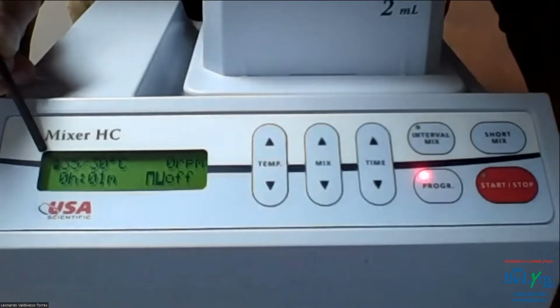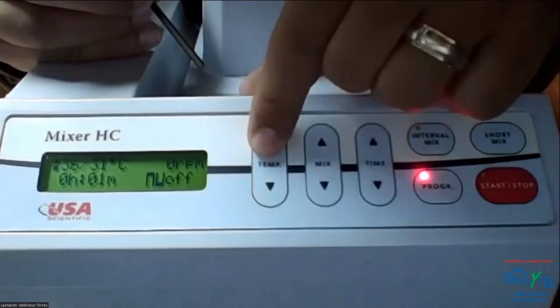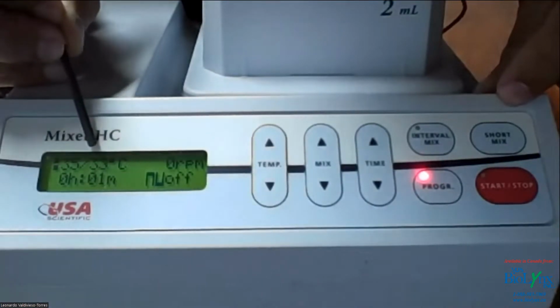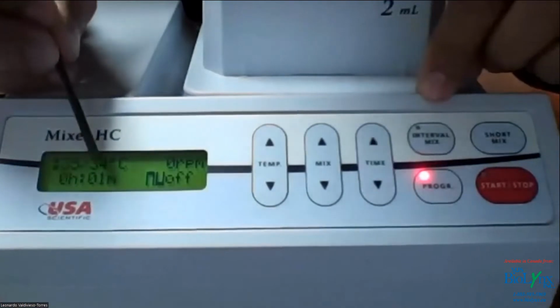Yes, sir. So that indicates that that's step 2. What we're gonna do is program step 2 to go to 35 degrees Celsius. You can say I programmed it to go to 35. Right now it's going up to 33, the actual temperature. And this is to adjust the time. I want to adjust it to 1 time.